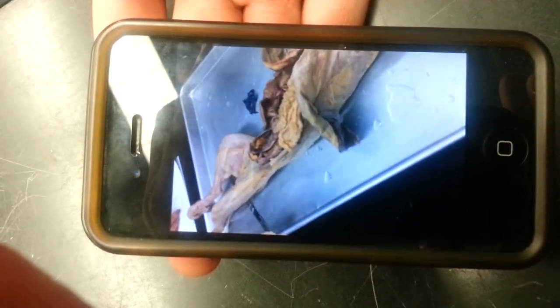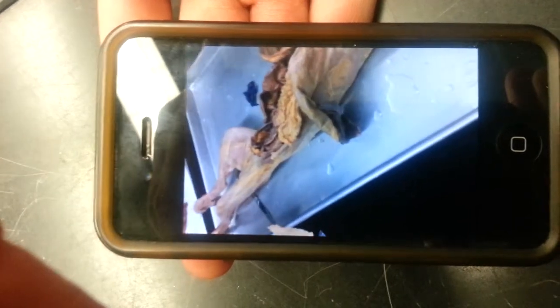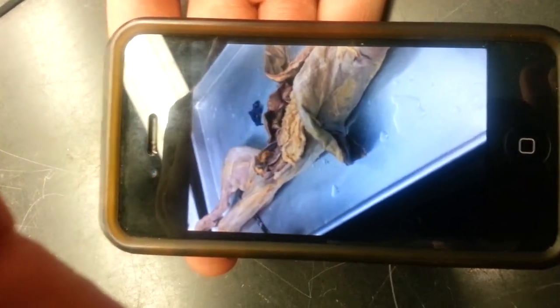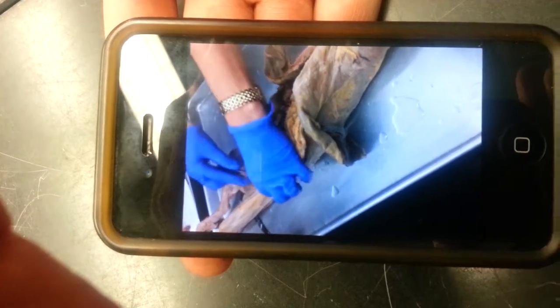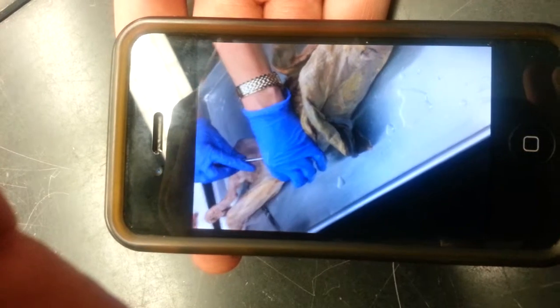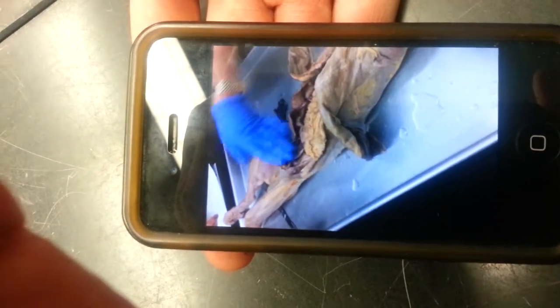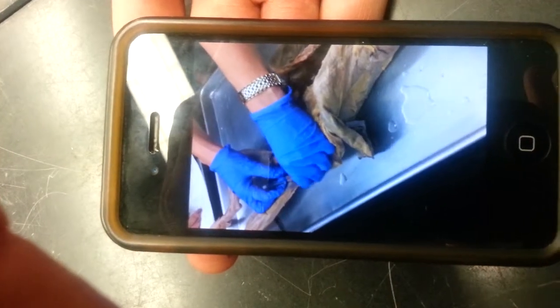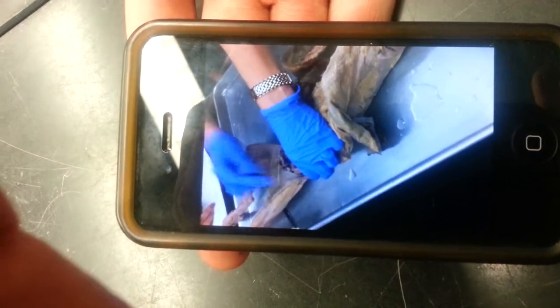We, as human females, are very different. We have a very big body, no uterine horns to speak of, and fallopian tubes that come out. So in the human female, what looks like the uterine horn in the cat is actually kind of what the fallopian tubes look like. I thought that was the case, and I had a student who was a vet, and he said, no, that's the uterine horns.